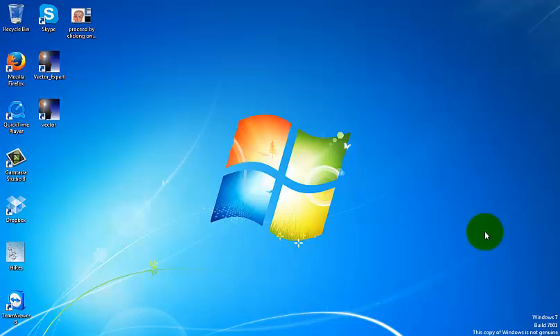Hello, this is Anna. In this video, I'm going to go through the major features of the software, and I will slowly mention almost everything that you will need to know and the important parts of the Vector software. So I'm going to start off by clicking the Vector Expert icon on my desktop.